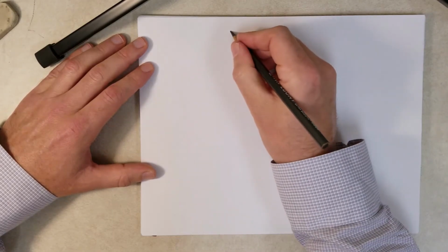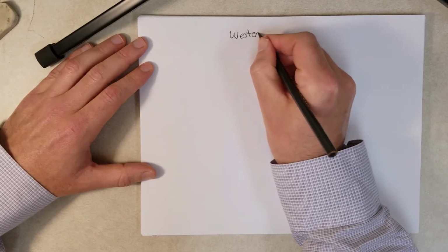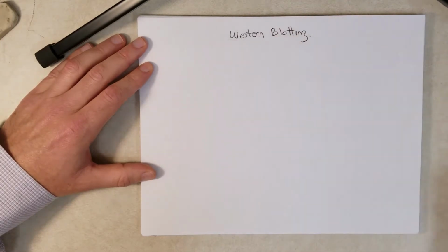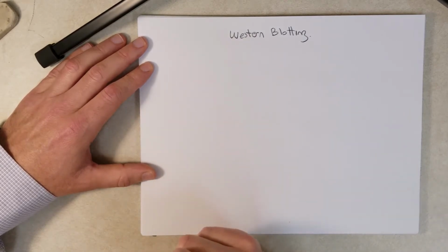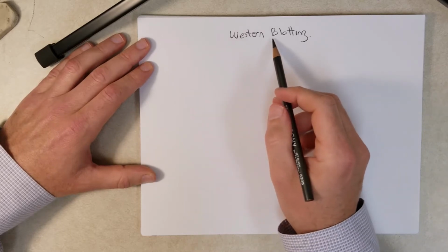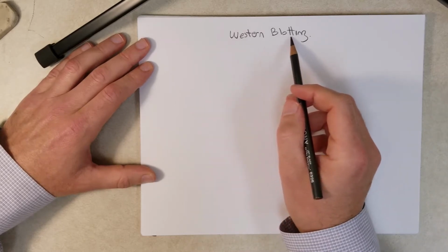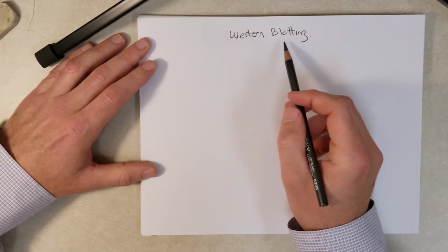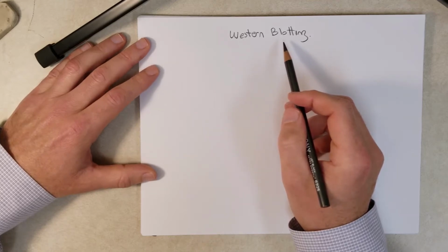Hey everybody, in this video we are going to take a look at Western blotting. This is a technique that one would use if, let's say, you are a researcher and you need to detect a certain protein, a specific protein among a collection of proteins. And I want to put this technique within the context of things we've already been talking about recently, in one of the latest videos.